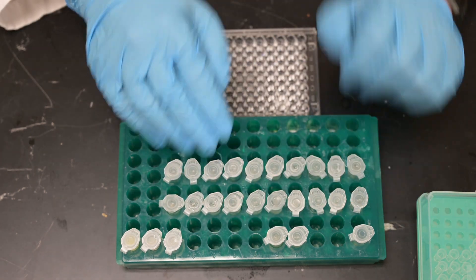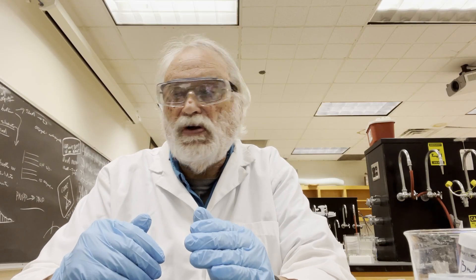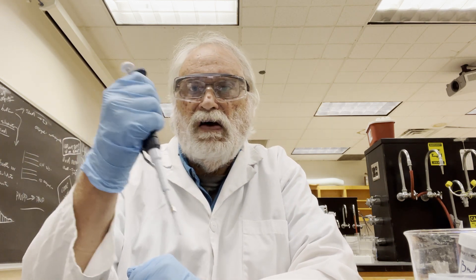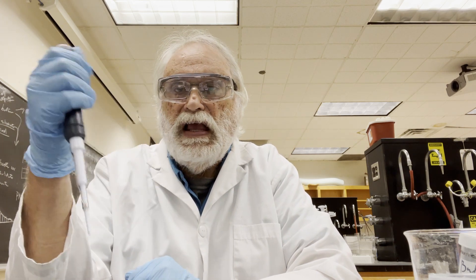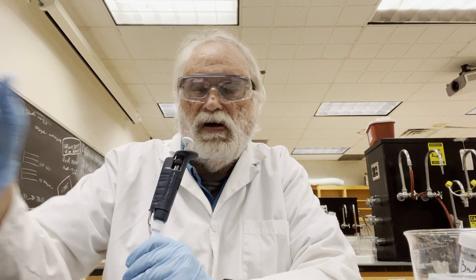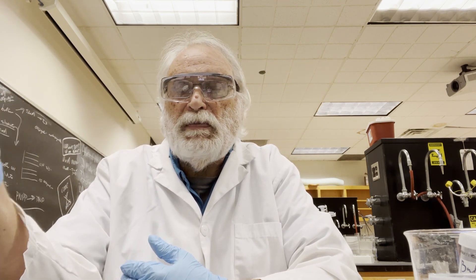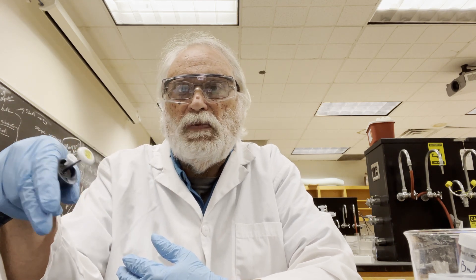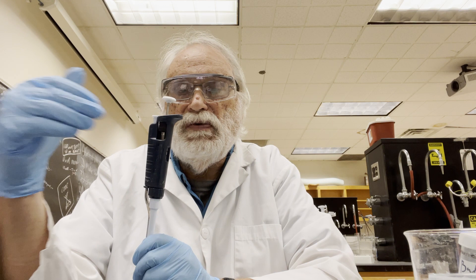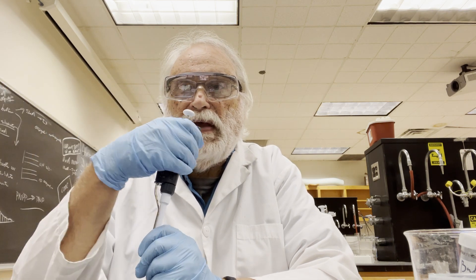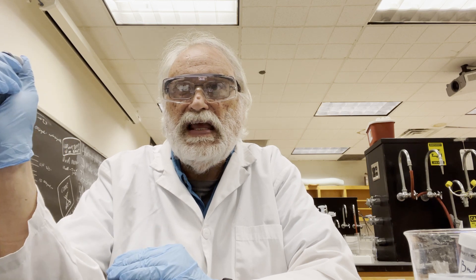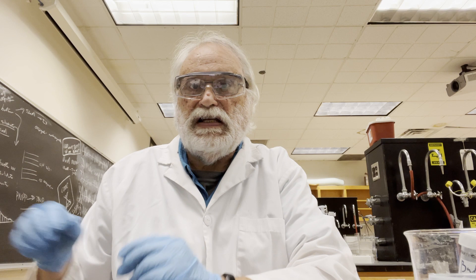So here we have all the samples laid out, and I'm going to walk through the protocol. What I'm planning to do is add all the enzyme samples to the wells, then add a substrate to all the wells, and let it incubate for 20 minutes. Then I'll repeat loading the plate with the same samples but using a protein reagent instead of buffer. Today I'll be using Bradford reagent because the BCA reagent hasn't arrived yet, but hopefully we'll use BCA, which I think is a better protein assay.